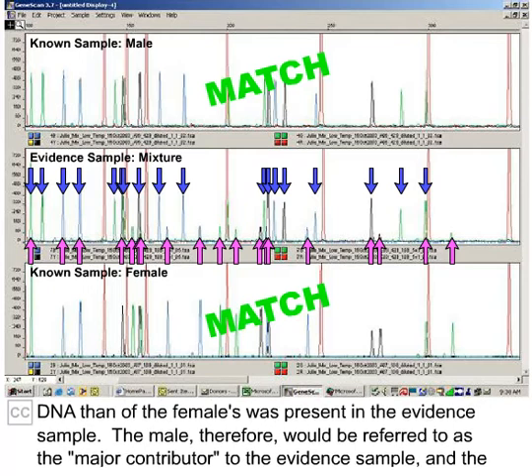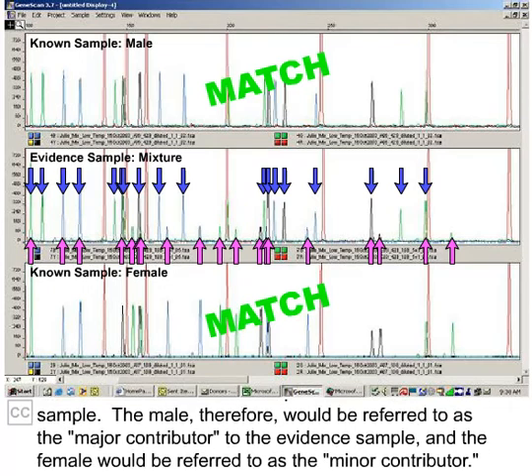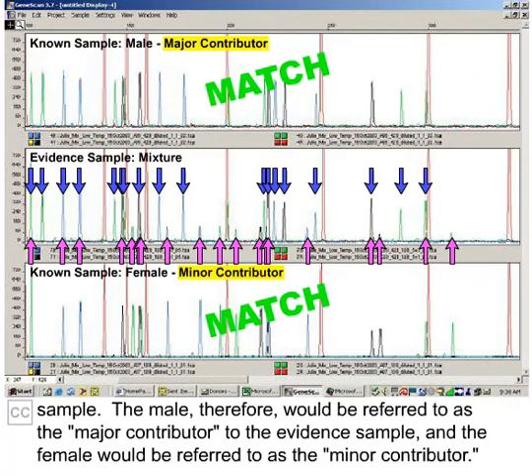The male, therefore, would be referred to as the major contributor to the evidence sample, and the female would be referred to as the minor contributor.